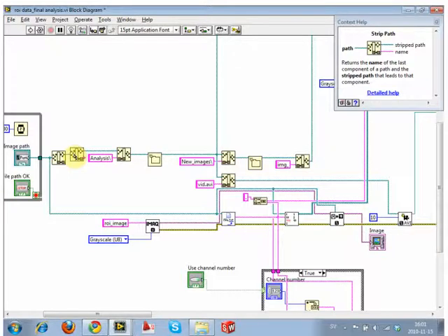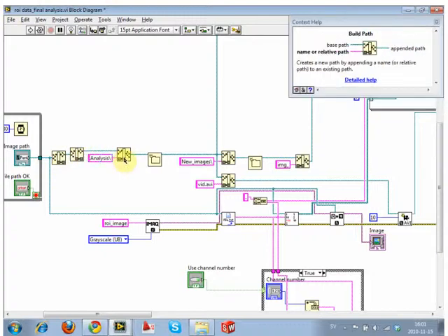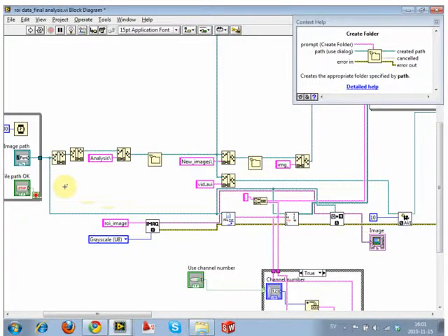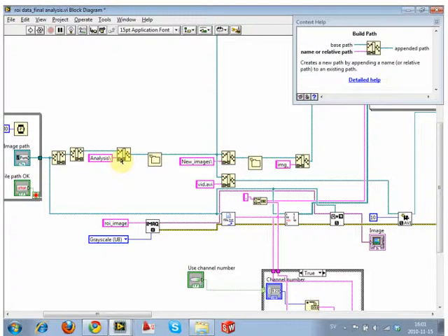So we go to the parent folder, we make a new folder, or a new path name, but we have to add a special switch to the end, because without this little slash, it thinks we're writing a file name. Even if we wire it into a folder, it doesn't know what you mean. And because these are moderately low-level VIs, there's no checks or balances in these. It needs you to wire it right, else it just says there's nothing, which kind of says you missed a wire, you didn't do something right. Without this switch here, it will just say this folder creation fails.